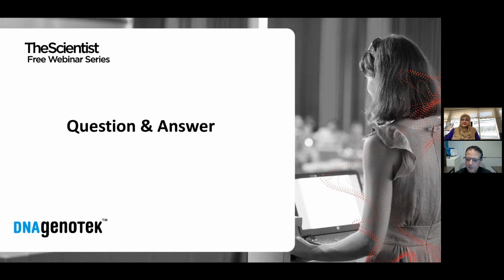Another question for Mike. Can the kits be used for DNA methylation studies? Oh, yeah, that's a good question. Definitely can be used for methylation studies. We have tested a couple of different methylation applications. One is on the Methyl EPIC microarrays from Illumina.